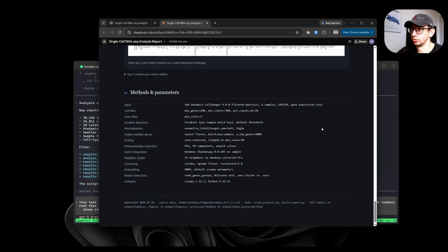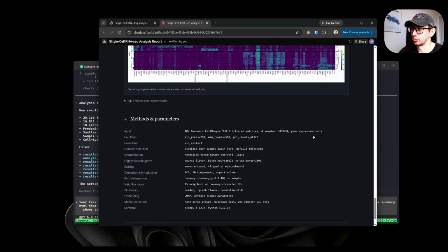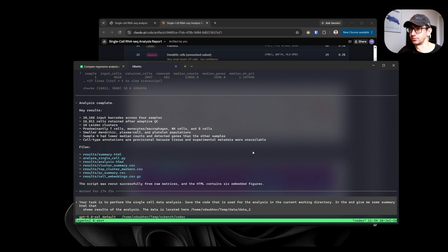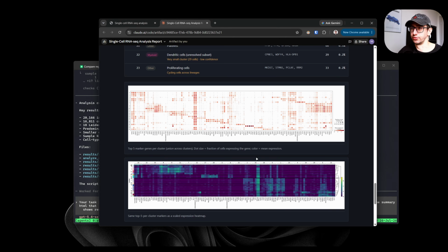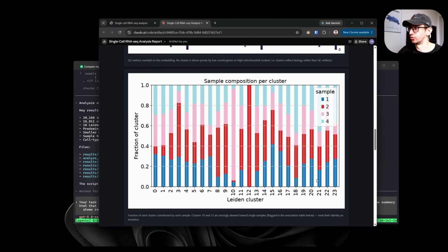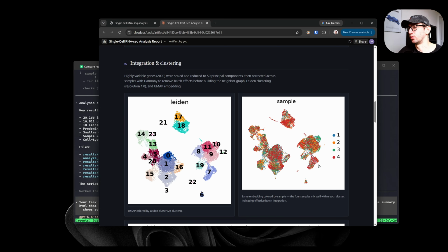Today I just wanted to briefly cover a particular case of models, and again I am saying that I didn't use extra information, so I definitely can, for example, steer the Codex CLI to get a nice result as well. But for me it was just a one-shot prompt. I tried to see what the difference is, and for a person who has never done single cell analysis, I would probably stick as a first step with Sonnet 5, because in my mind it's more reasonable and more accurate. Anyway, you need to know the details about the analysis.